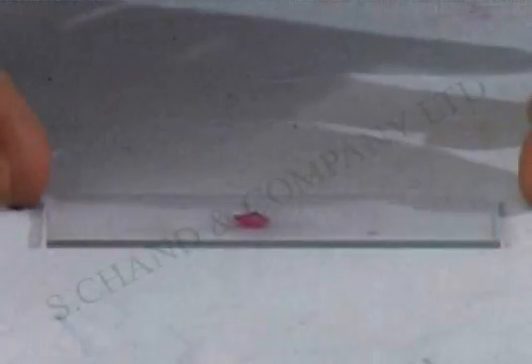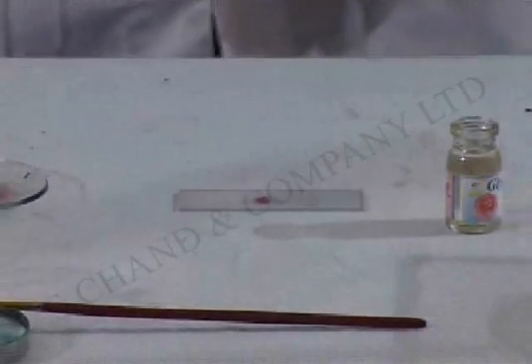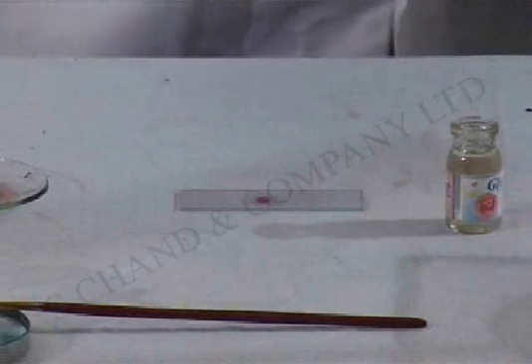Out of the peel that you just saw which we have put on the slide, we have taken a smaller piece and made it into a neat square. Now I am going to use glycerin. We add glycerin to this to keep it sufficiently moist. Add just about a drop of glycerin to this.